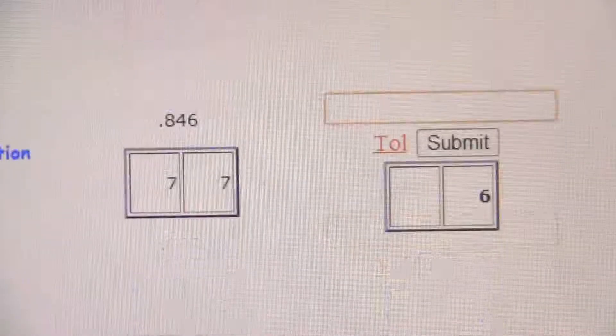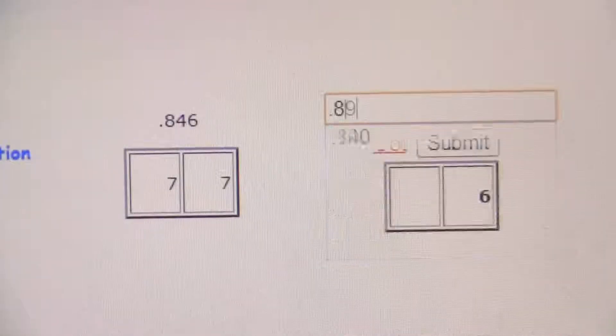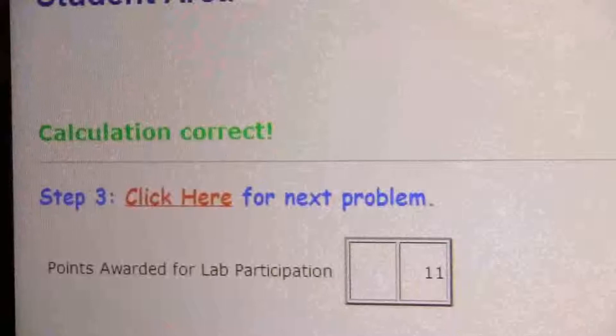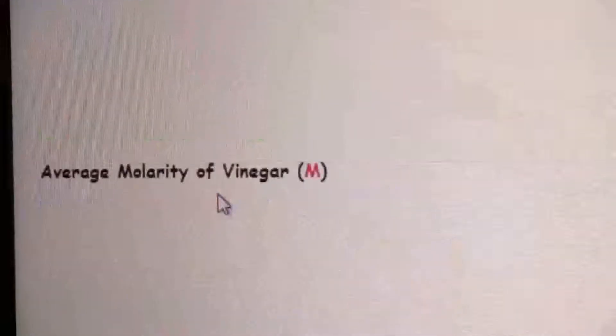So I put that here in Chem 21, 0.8918, and very good.